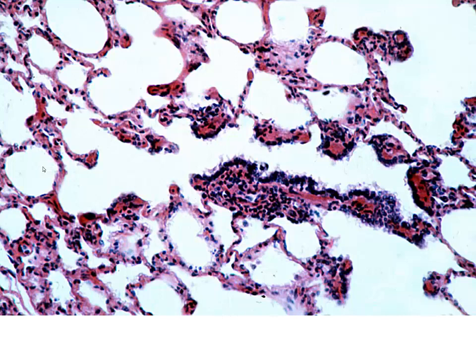Again, another view of a bronchiole, we can see our spiraling smooth muscle. This looks to be relatively intact. However, if you look on the opposite side, you can see the interruptions to the mucosa. And with those interruptions, then we've got to say that this is going to be a respiratory bronchiole. We don't see the terminal far enough upstream. And as we leave that intact mucosa and we move into this area, again, where we see our smooth muscle knobs, now we're moving into an alveolar duct.